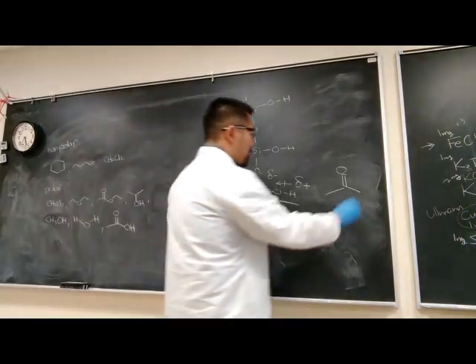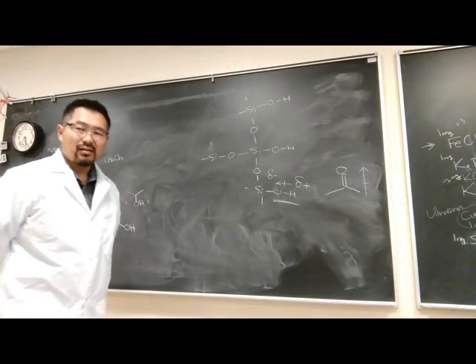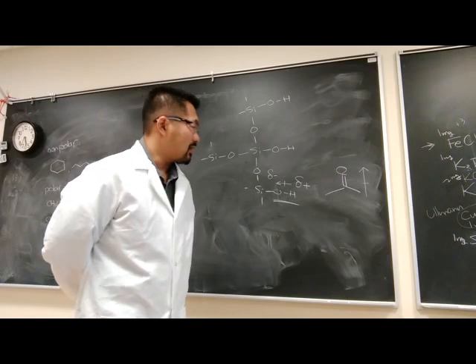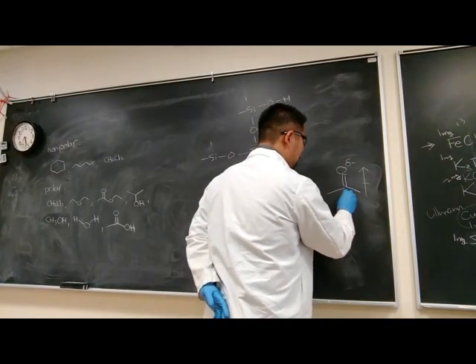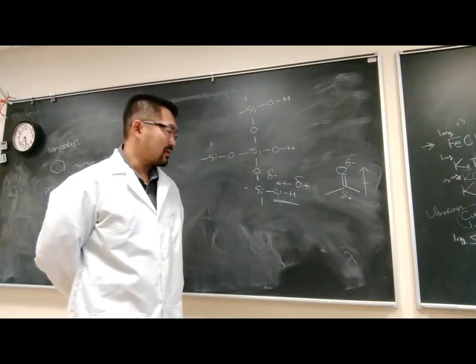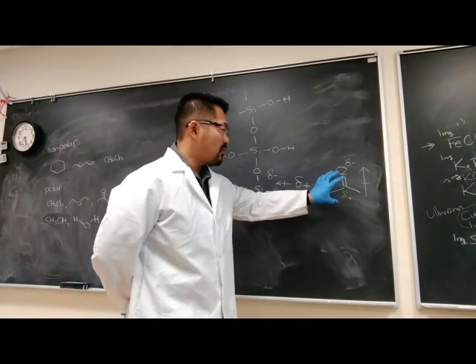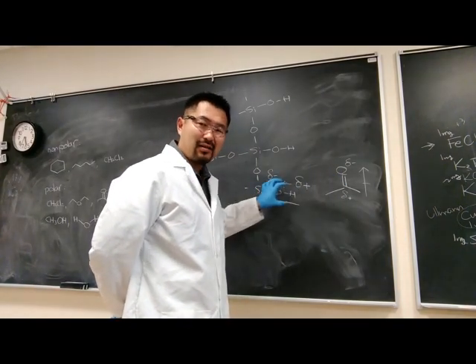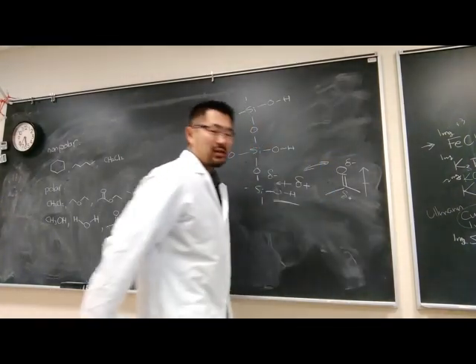This has a polarity to the molecule. The oxygen is a lot more electronegative than carbon, so there's a partial negative charge and partial positive charge in this molecule acetone. Because this is polar, when a polar compound comes in contact with silica gel, there's going to be an attraction between the two.